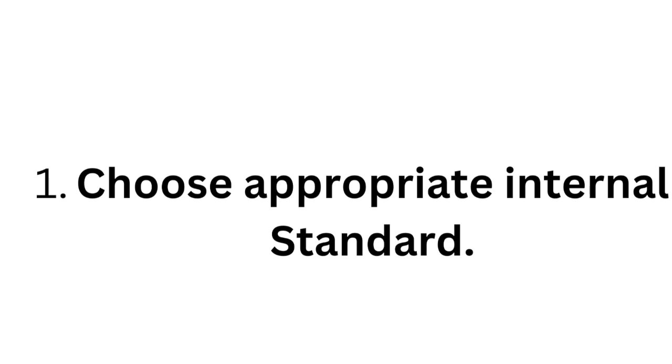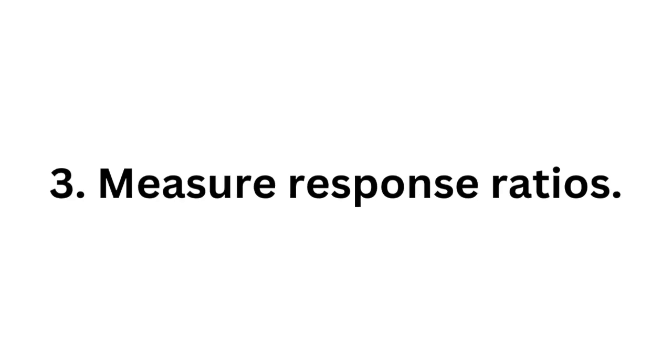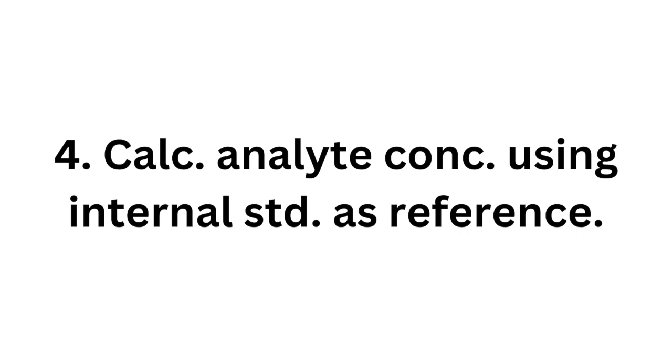Step 1. Choose an appropriate internal standard. Step 2. Add it in a consistent amount to all your samples, standards, and blanks. Step 3. Measure the response ratios. Step 4. Calculate the analyte concentrations using the internal standard as a reference.